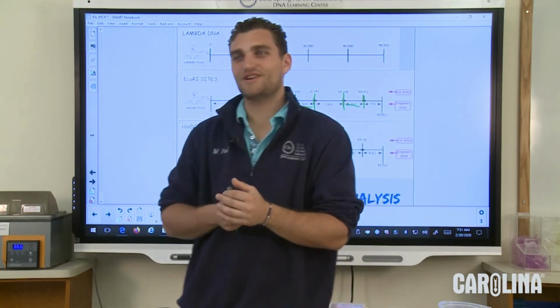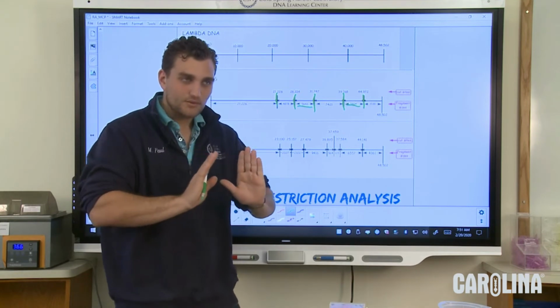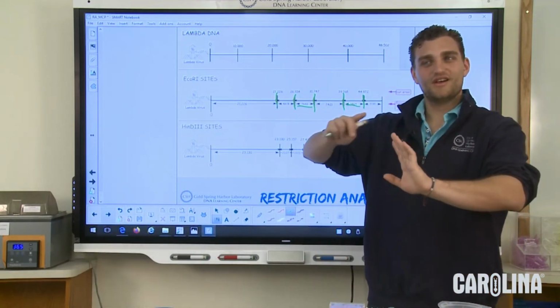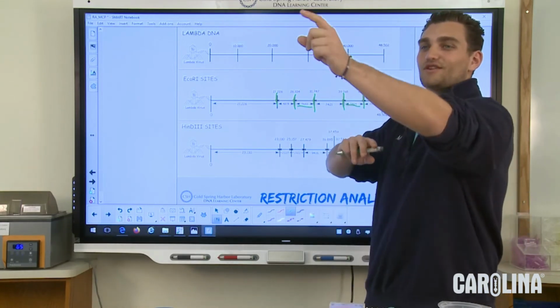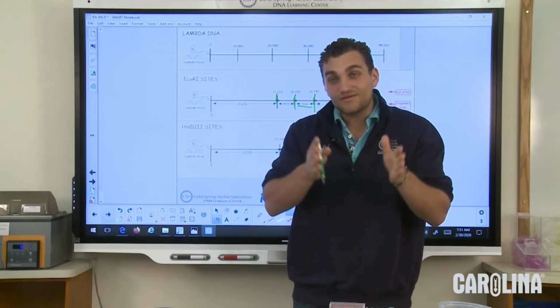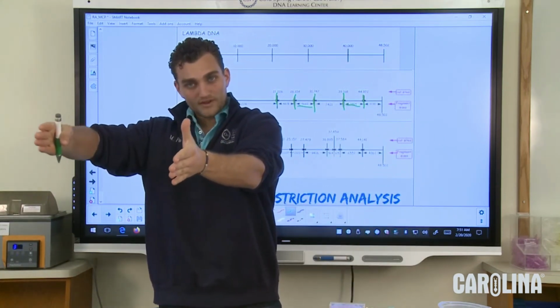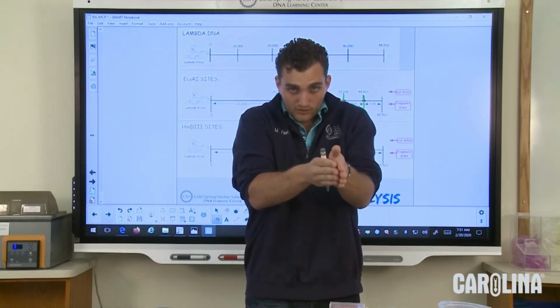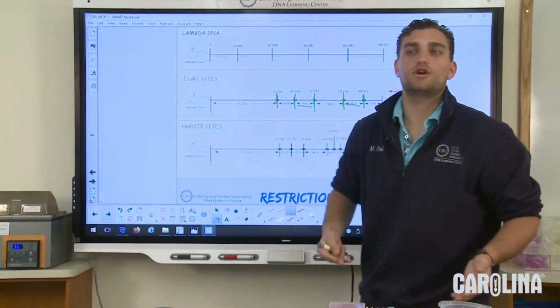This is a tricky question, right? So if I need those two to separate out, I'm pushing them with the same force. I don't do a PCR, a polymerase chain reaction. I run the gel longer. Awesome job. Yes, I run the gel longer, and that will help to increase the time when it's running. And over time, the difference will start to become larger, right? So it'll start from being really close to each other, and as I run it longer and longer, the separation starts to occur a little bit more.